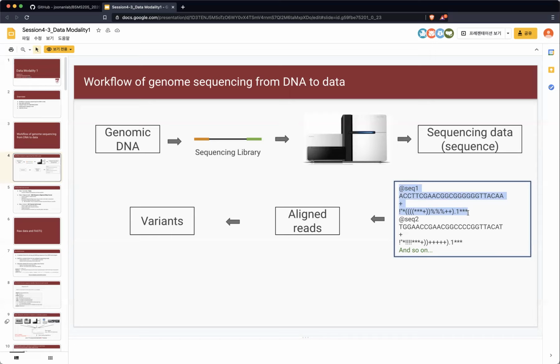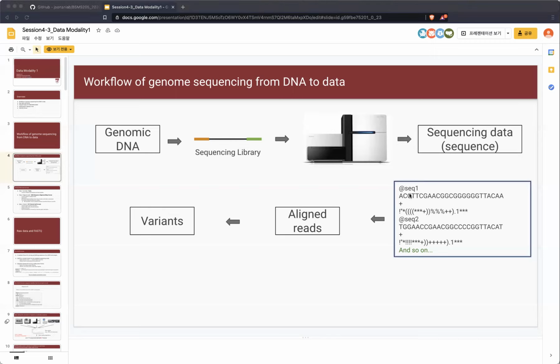And if you remember, when we do Illumina sequencing, we normally get millions of reads or sometimes billions of reads. So lots of reads from the sequencing machine. That means each read represents this information, right? So if you do 150 million reads, that means you collect 150 million chunks from the sequencing data set, right? So this is the large data set you get from the machine.